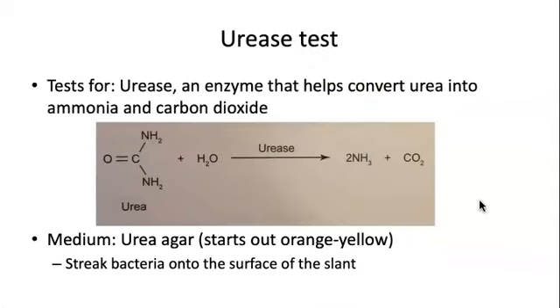Yet another test that looks at the breakdown of protein is the urease test. Urease is an enzyme that helps convert this compound called urea into ammonia and carbon dioxide.